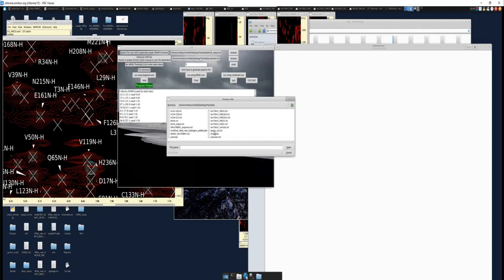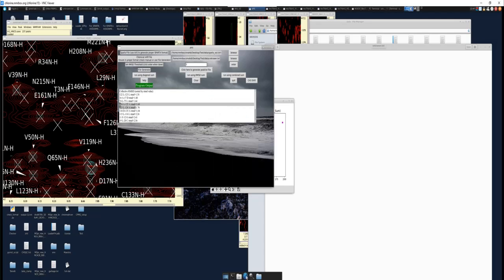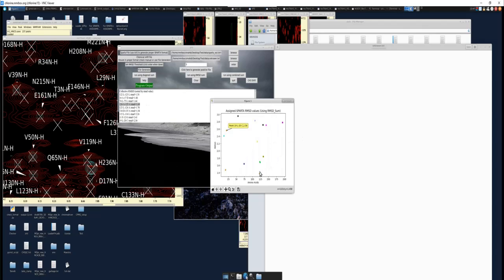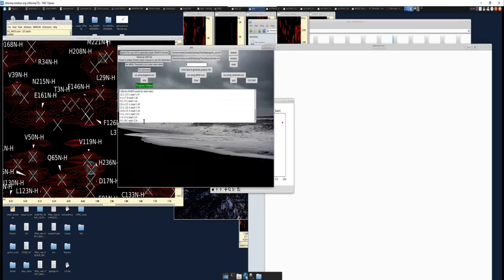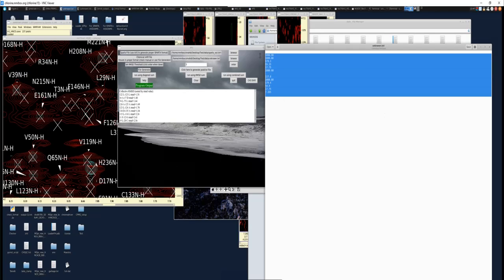Whereas if we use the Sparta, and clear, you can see that the 124 here shows up, you don't even see the other one. You don't even see 155. So using this pair, you're actually able to know which alanine-alanine pair this is in your sequence. Whereas using the BMRB, you can't really differentiate between the two. So that's some of the pros and cons.